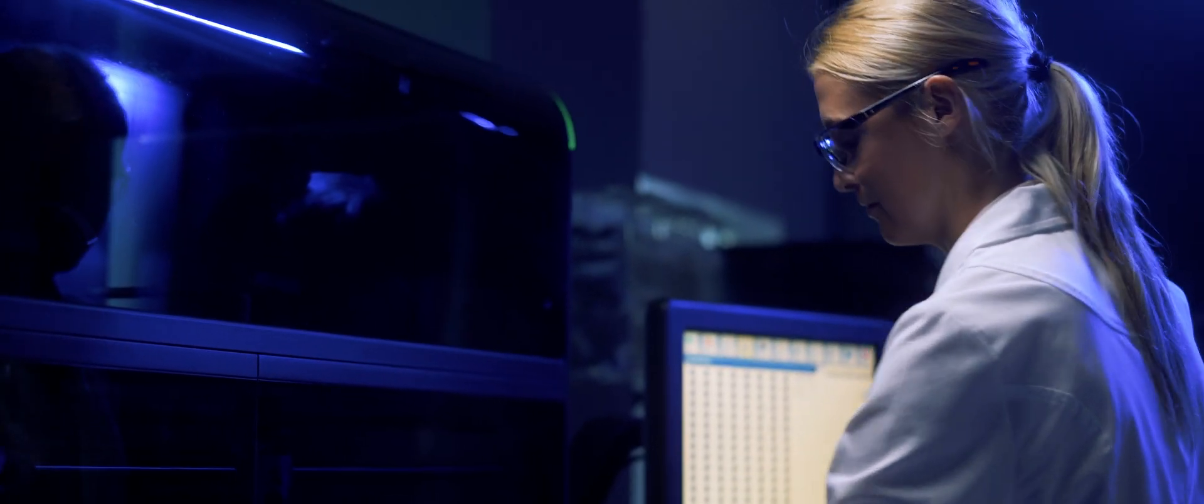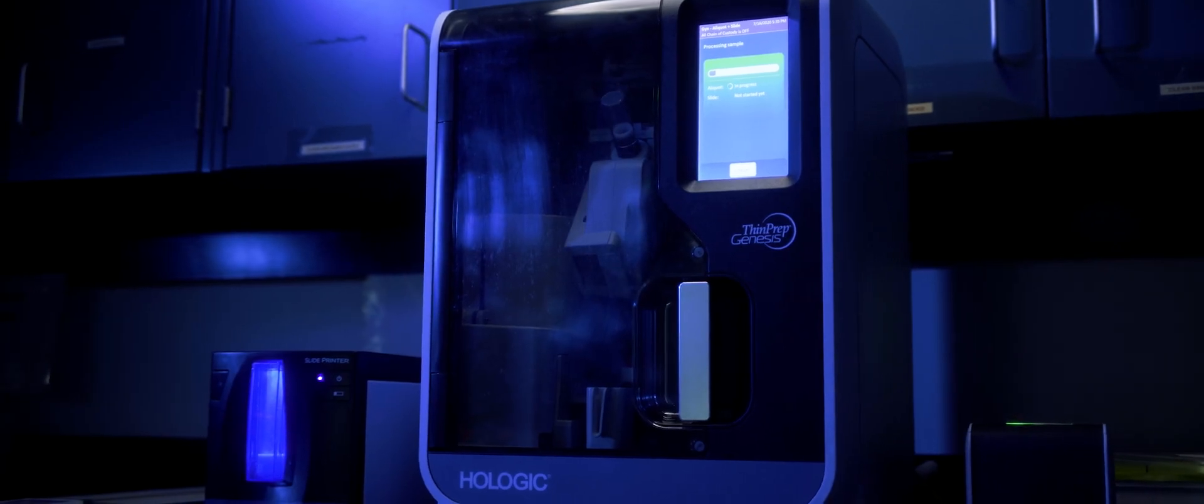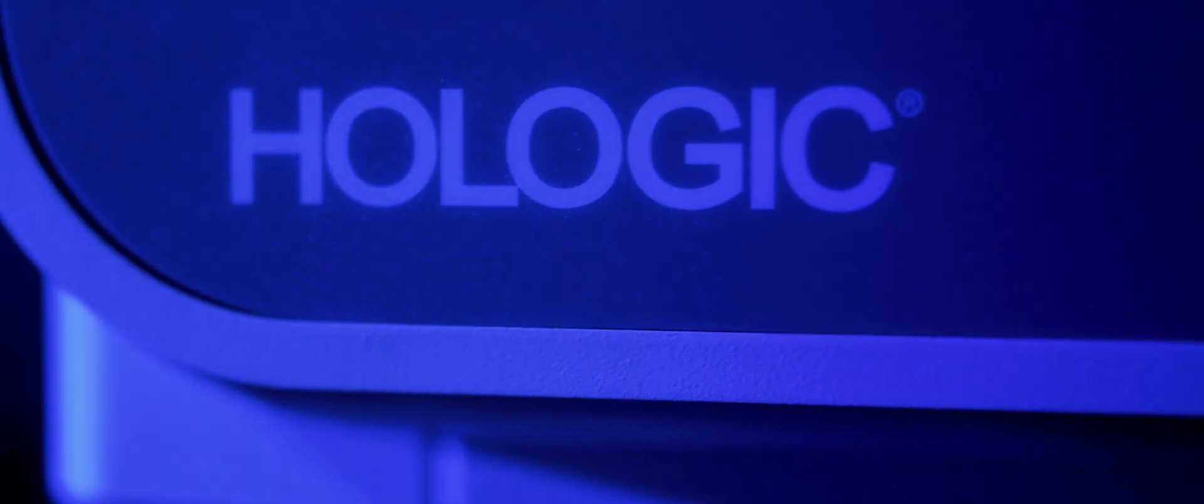From the same trusted brand and technology that customers have known and relied on for over 25 years, we introduce the next step in your lab workflow. The ThinPrep Genesis. From Hologic, the science of shore.